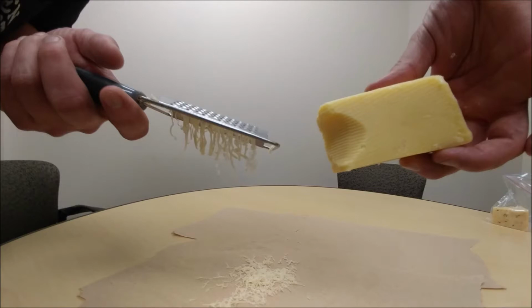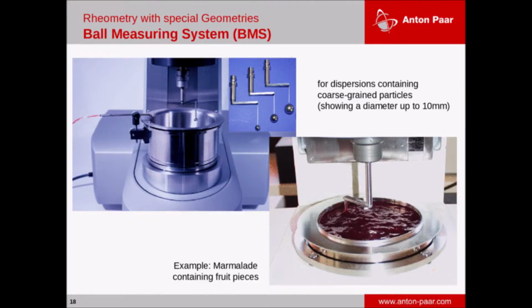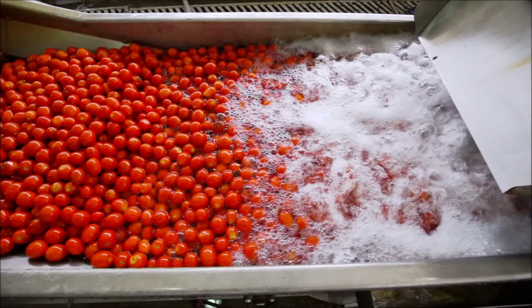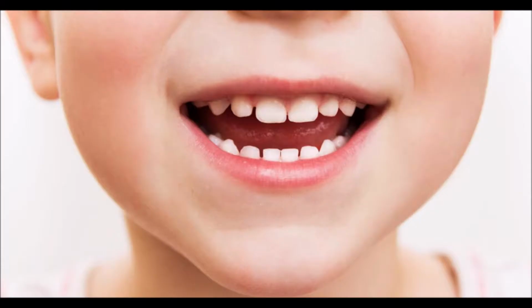Since there are many different types of food products, each with their own processing needs, it is important to make sure that you have the right tools at each stage of processing. By performing tribology testing on different foods or materials used in processing equipment, scientists can also model processing conditions experienced in a manufacturing facility. This can be important for selecting components in plant design or for designing process lines for producing foodstuffs. Another area that tribology can be applied to is your mouth.